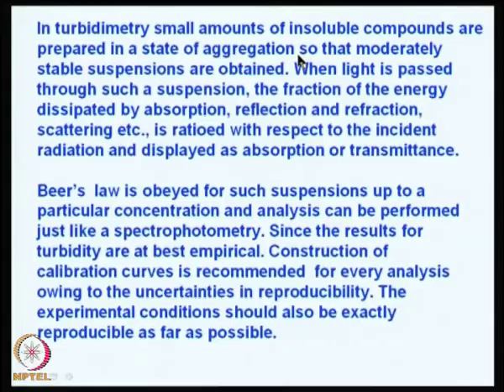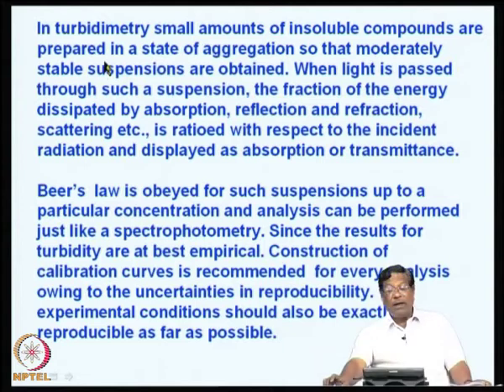Now, let us come to turbidimetry. In turbidimetry, what happens? Small amounts of insoluble compounds are prepared in a state of aggregation, so that moderately stable suspensions are obtained.